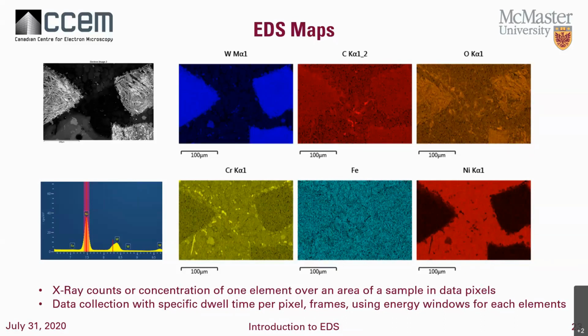So usually you don't want to go much lower than 50 times, but you may have some issues with your particular SEM. So ask about what sort of magnification should be the minimum. Now, when we're talking about maximum, you have to keep in mind the spatial resolution of things. There's no point going to 50,000 times in the SEM. You're going to have a lot of overlap of data. So that's not really the best thing to do.